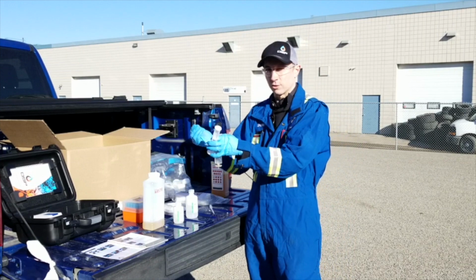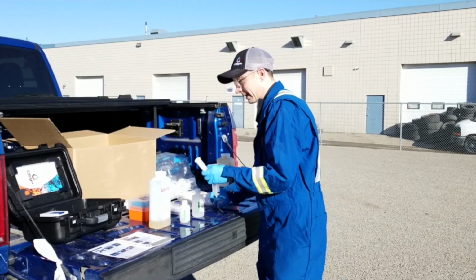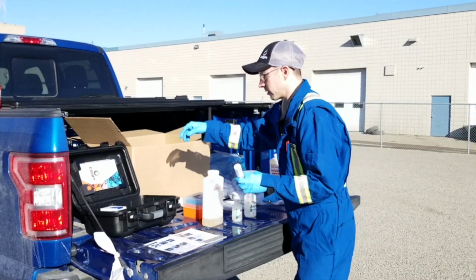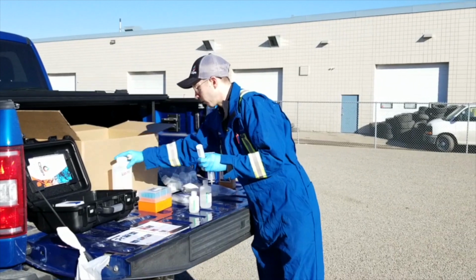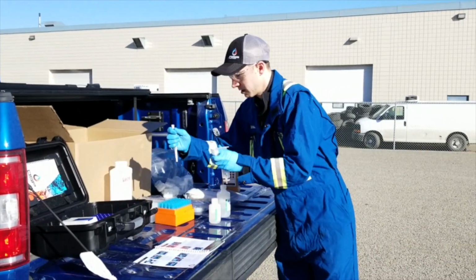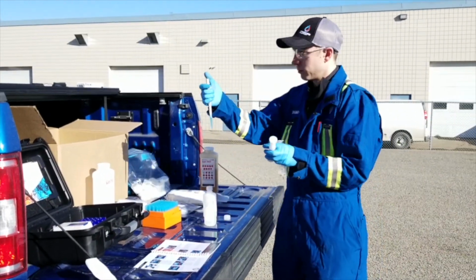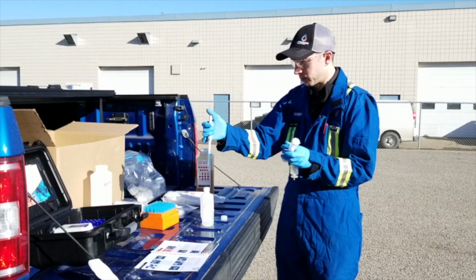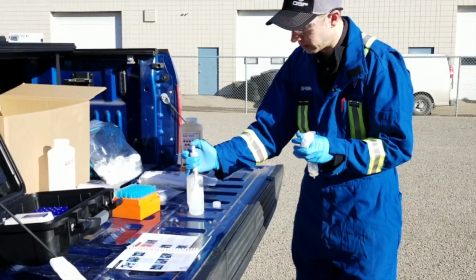We're going to now extract the ATP that's within any of the active cells. We use reagent X for that. So we're going to grab our beige micropipette here, our 1 mil blue pipette tips, and we're going to grab reagent X here. Push the plunger all the way down. Always hold it upright. Push the plunger all the way down, place it in the reagent X, and let it slowly come back up.